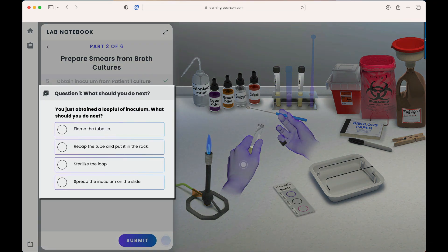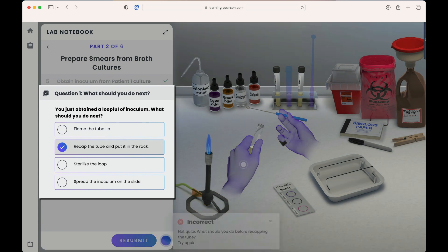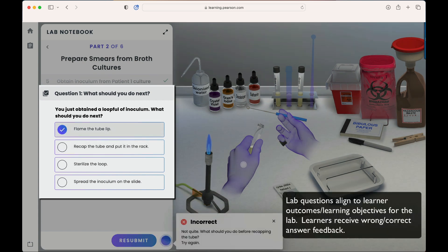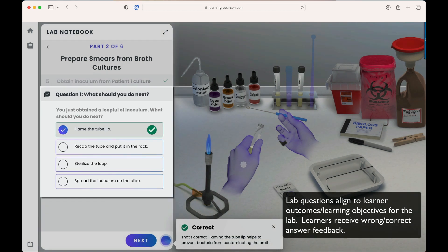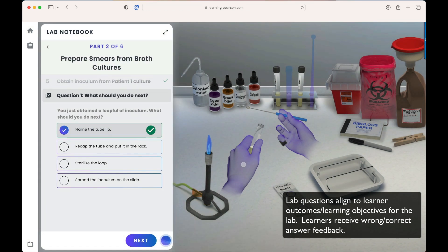We are then asked to answer a question: 'You just received a loop full of inoculum. What should you do next?' We'll receive feedback based on our answer to assist in our learning journey. In this case, we should flame the tube lip.